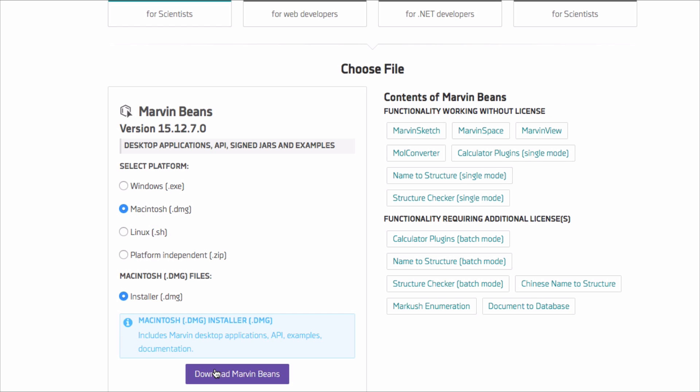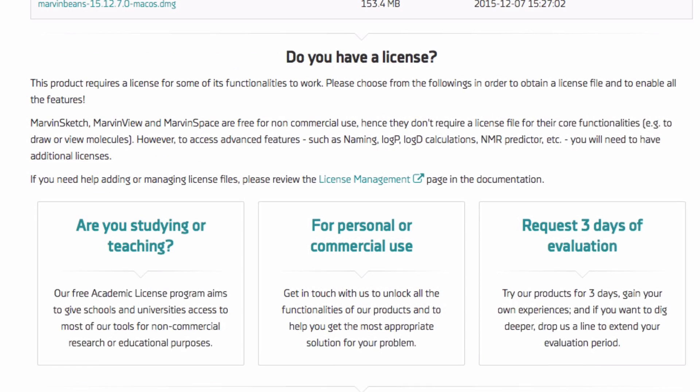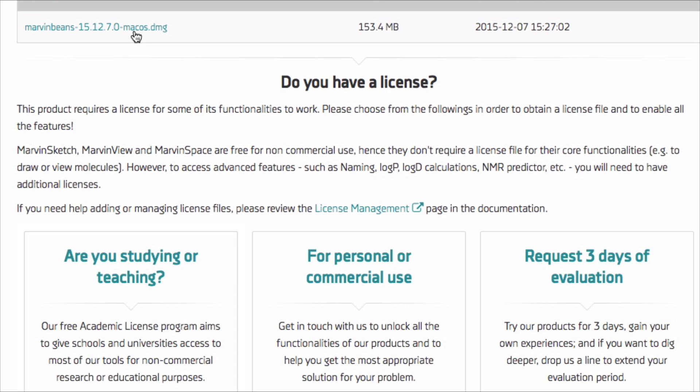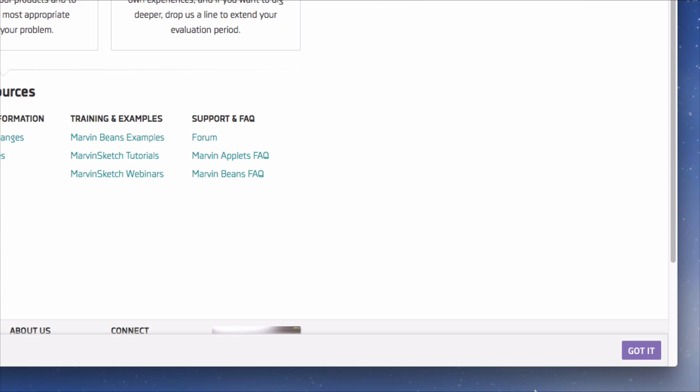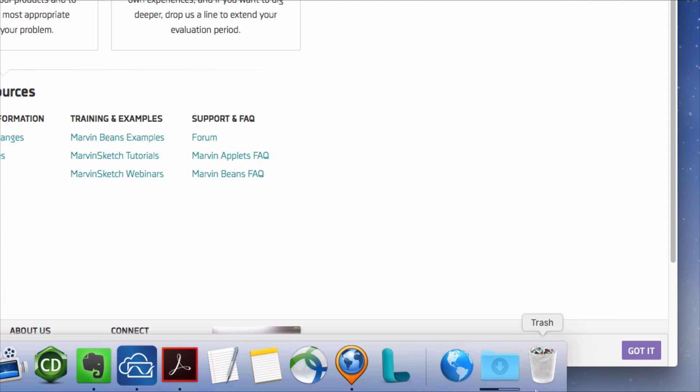For now, click the download MarvinBeans button. Click the link to download the software to your computer. The download should only take a minute.